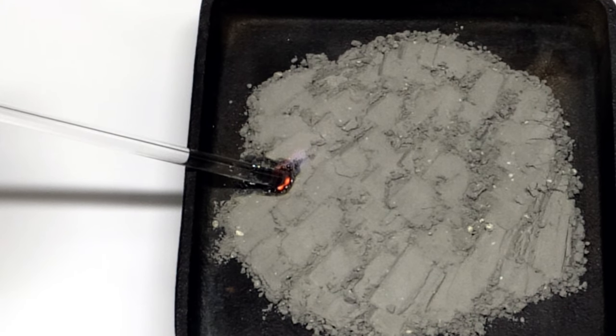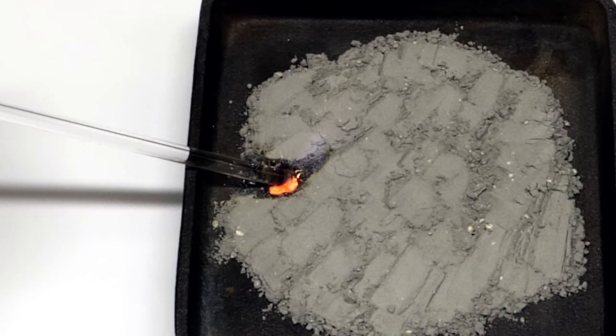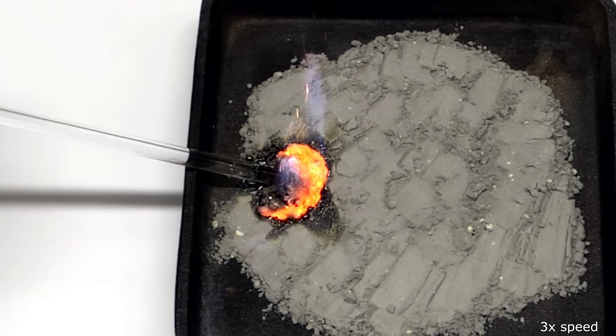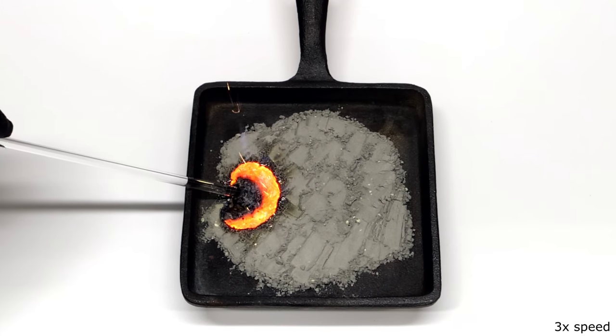It almost immediately liquefies the sulfur, which then reacts with the iron, and this generates a lot of heat. It's enough to keep the reaction going, and it goes until it all burns.